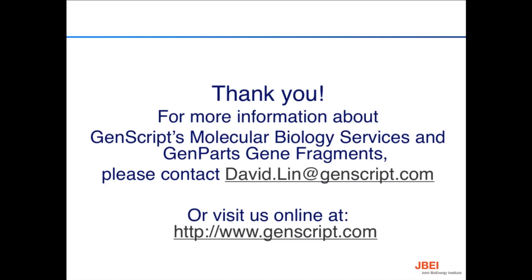At JBay, we've been using gel electrophoresis, and specifically the Coastal Genomics / Hamilton Nimbus system for automating some of the gel purification processes. If throughput is really essential, again, there are different trade-offs with each of these categories. Maybe the gel electrophoresis is slower and more expensive. Columns generally are going to work really great. You can do a multi-well plate format. But if you have contaminating bands, that might be problematic. And you might be able to just get by with very old school approaches too. But again, there are going to be different types of trade-offs.